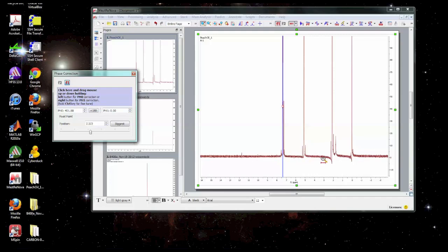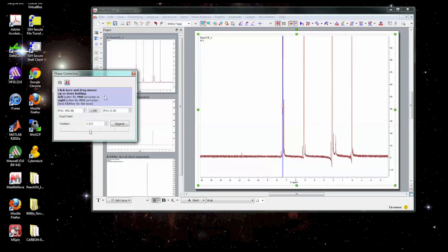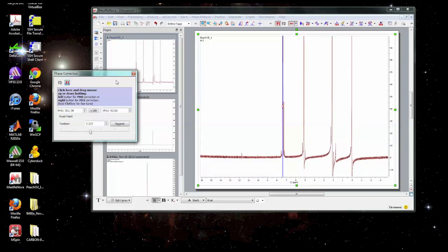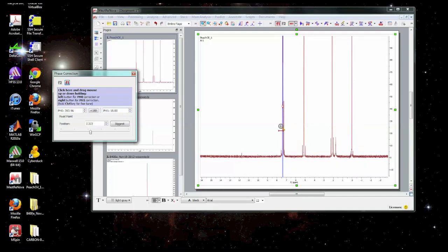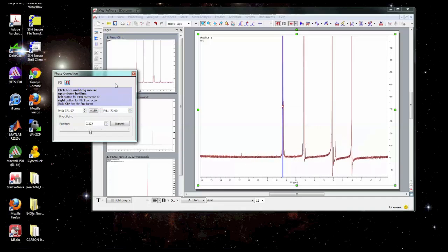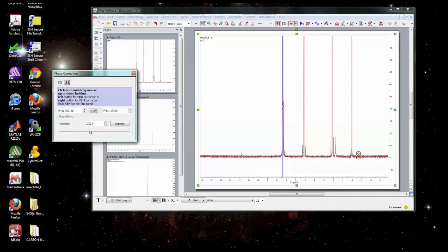So that one looks perfect but now we can see some of these other ones aren't perfect and if I fix one of the other ones with the zero order this one looks bad. So we can't fix them all simultaneously. That's why we need the first order phase correction. So I'm going to use the right mouse button and adjust the first order phase correction and you can see that first order phase correction affects the entire spectrum but leaves the peak at the pivot point alone. It actually has an increasing effect as we move away from the pivot point and no effect at the pivot point.